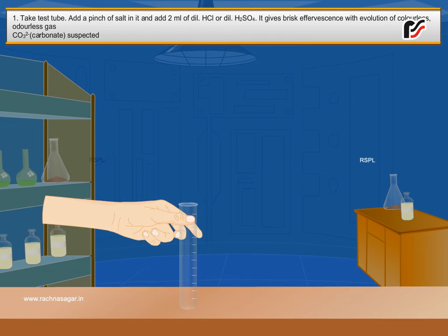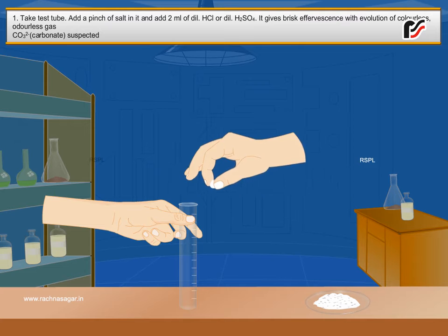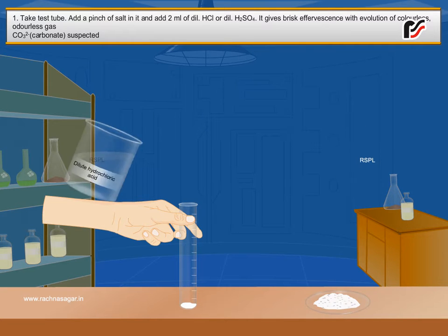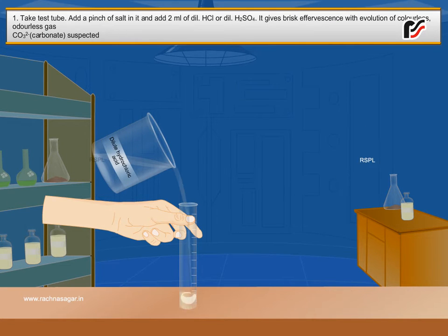Take test tube. Add a pinch of salt in it and add 2 ml of dilute HCl or dilute H2SO4.